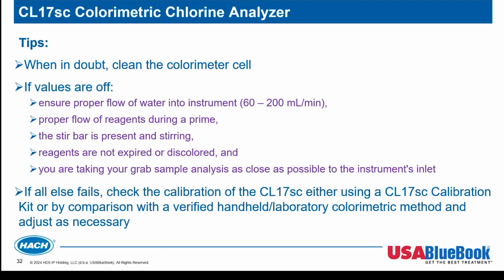The stir bar is an important part. It's also very easy to lose because it is magnetic. So make sure that thing is present and stirring. Make sure reagents are, of course, not expired or discolored.